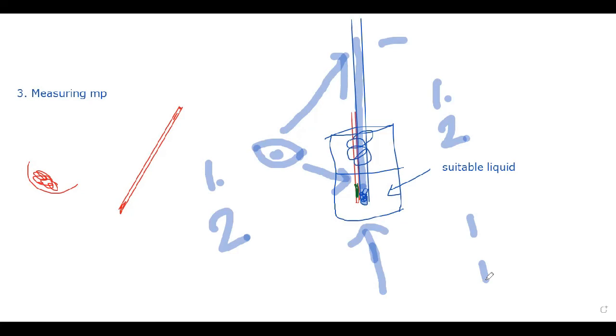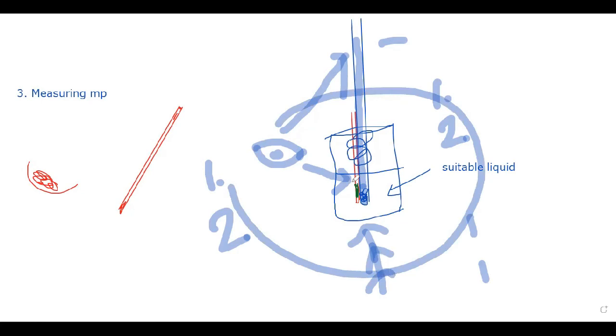Once one temperature, another time a different one. This may happen, and it can be due to other reasons. For example, if you heat quickly or slowly, it may depend on that, and you can make a wrong result. And this should be slow. The slower you go, the better the result. Understand? So this is how we measure the melting point of the DNPH derivative.